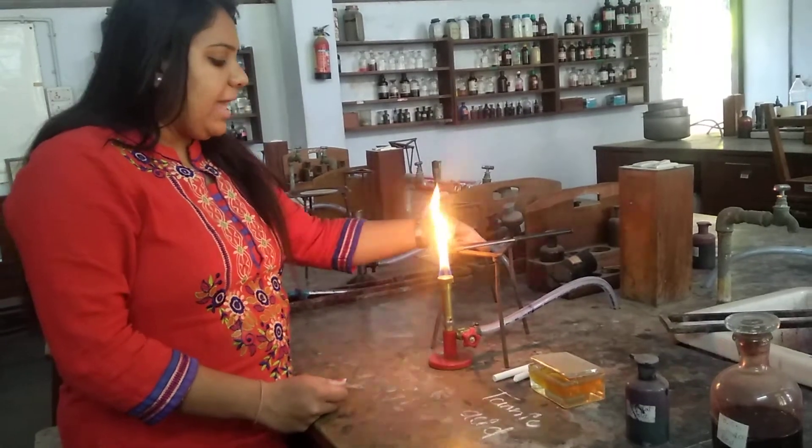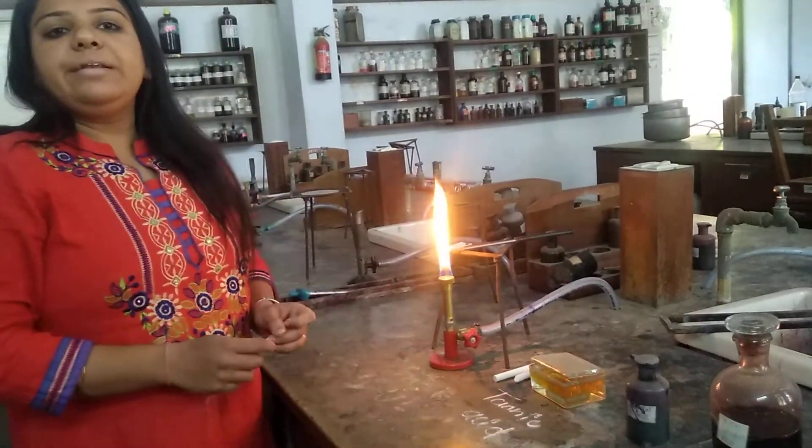Now we need to keep it for air drying. We will let the smear air dry.